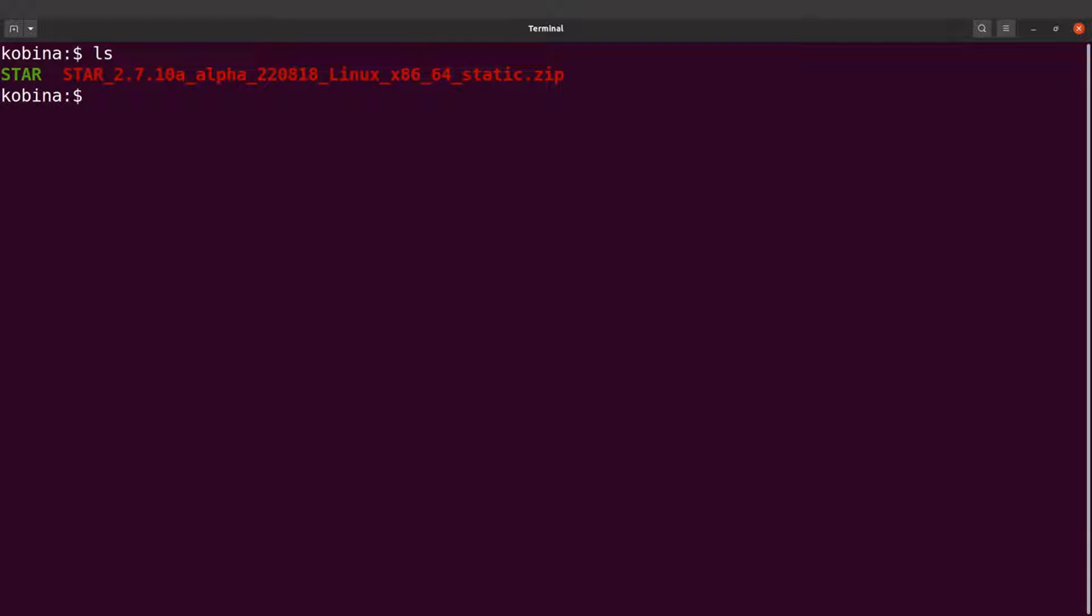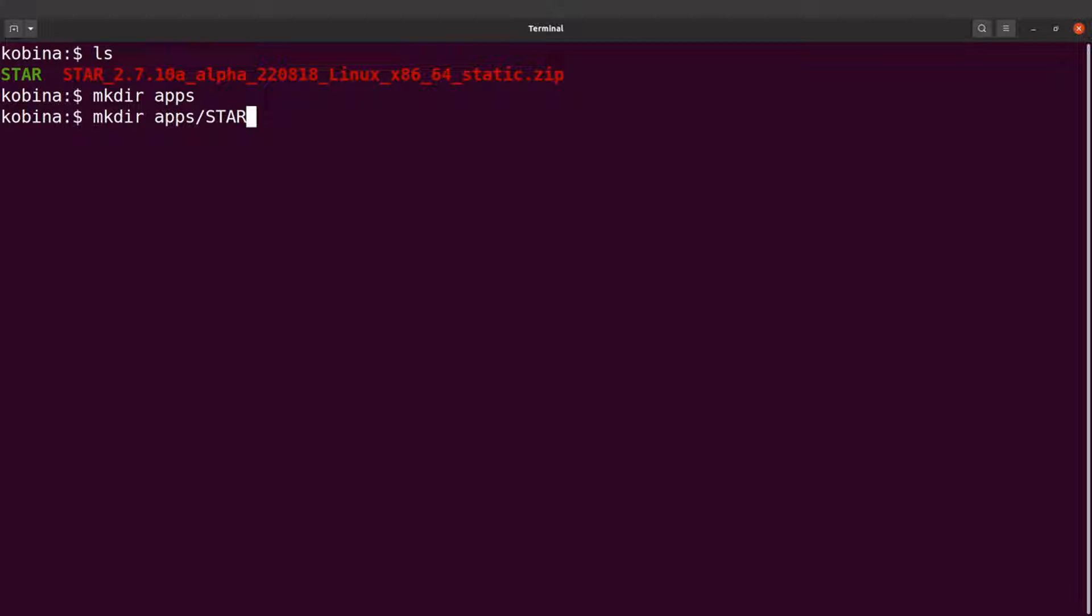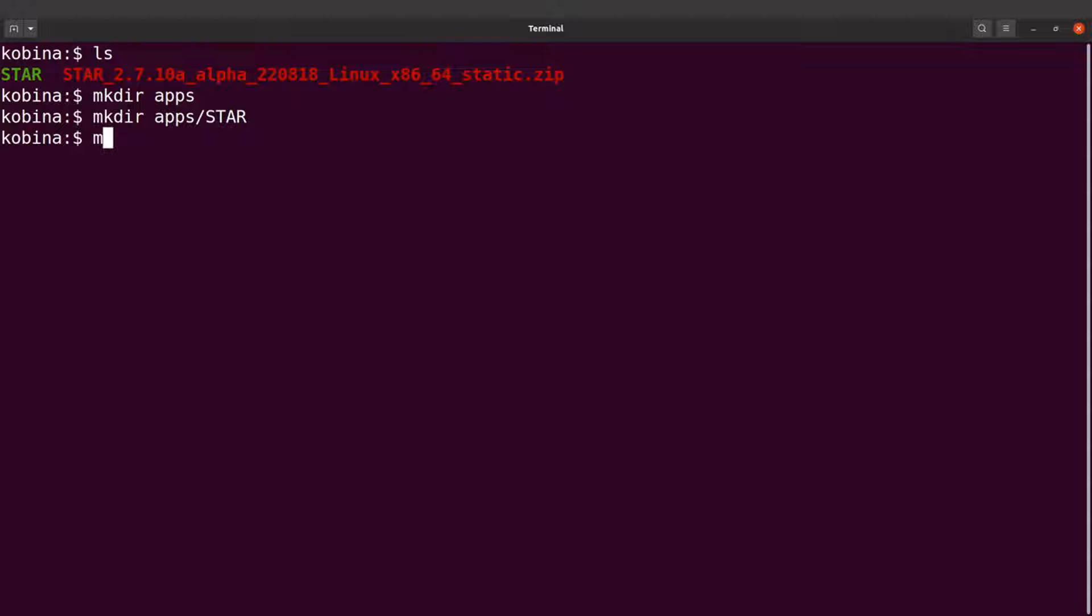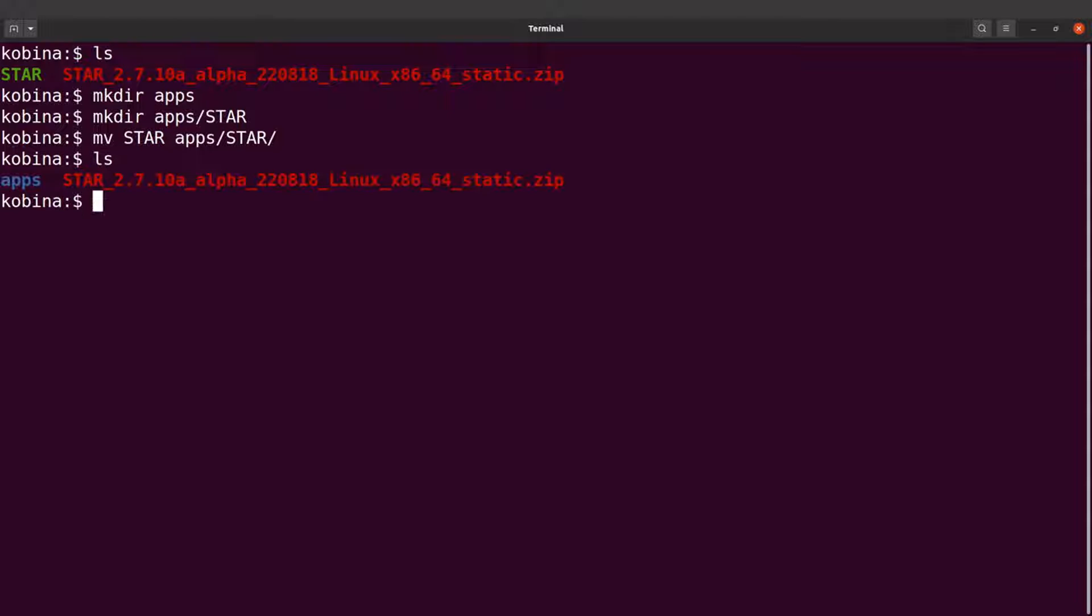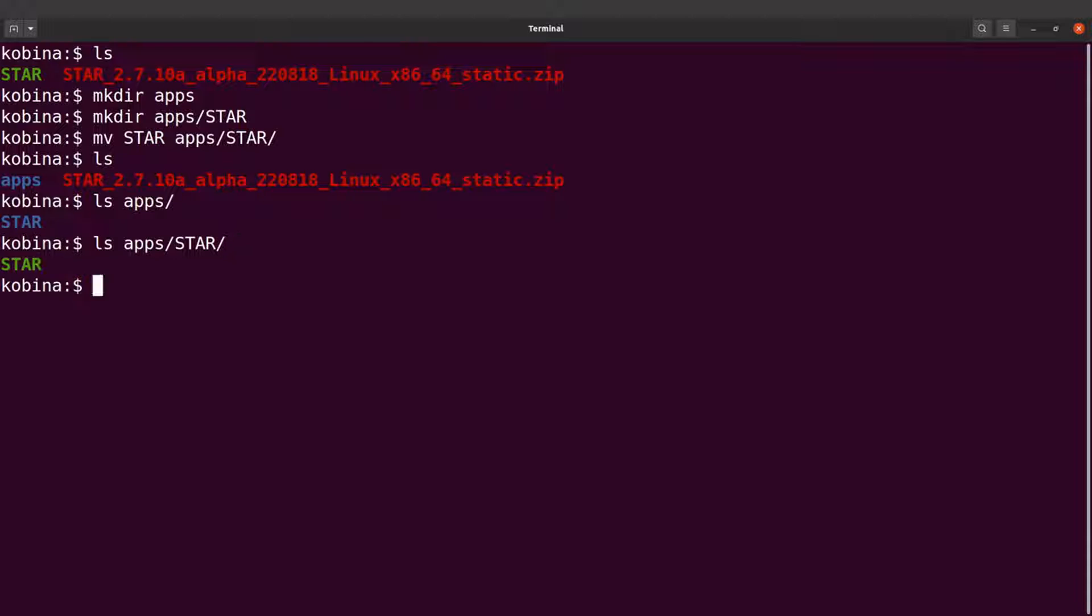What I'm going to do next is to create a directory and then move this executable into it. I do this because it helps me to organize my files. So I'll say mkdir apps, and I will say mkdir apps slash STAR. And then I'll move the file into the STAR directory, so I'll say mv STAR apps slash STAR.